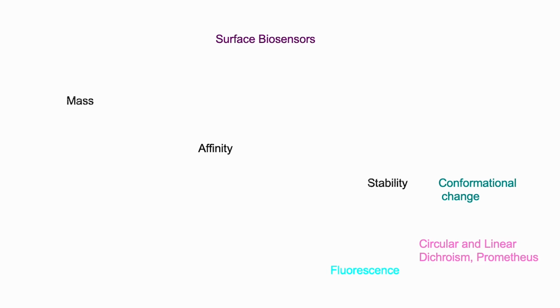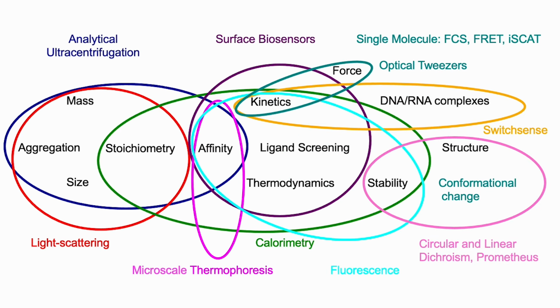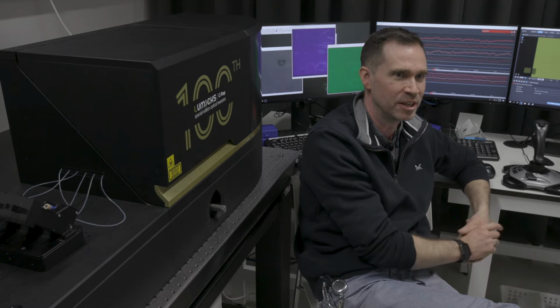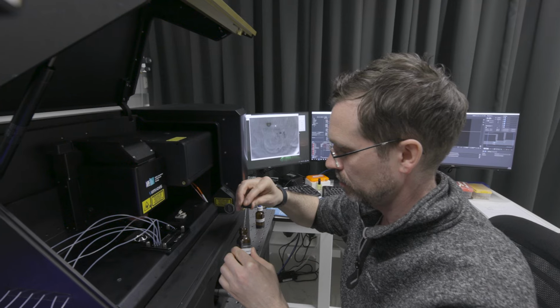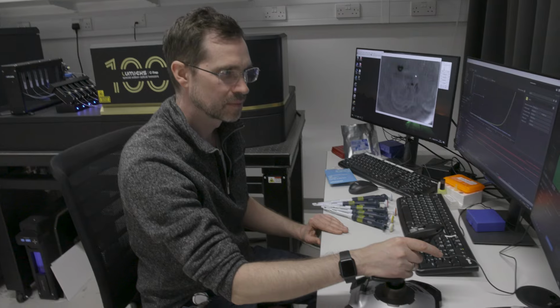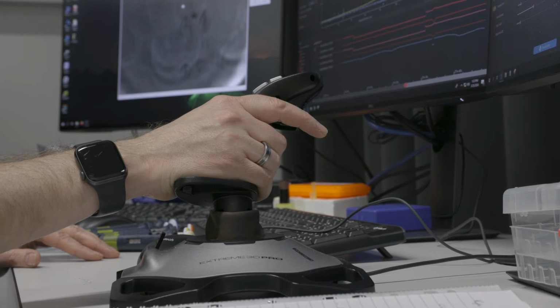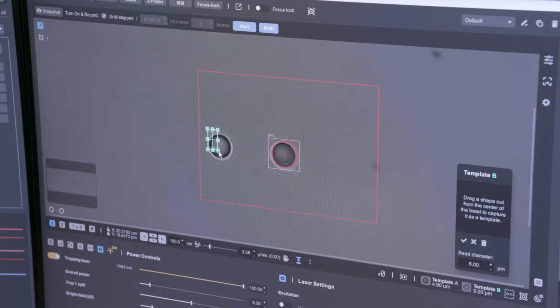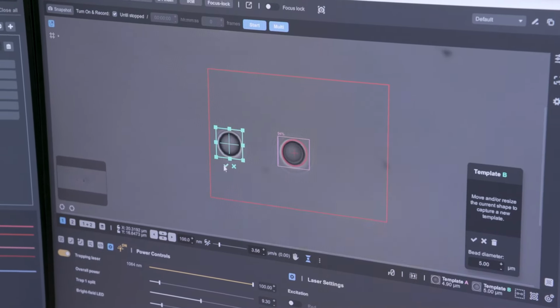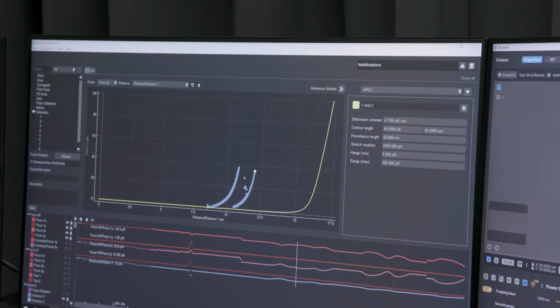Yeah, it's amazing, really. We must have 20 different pieces of equipment, all sorts of different biophysical techniques, where in previous labs where I've worked, you maybe have one or two or access to a third. We've got such a broad range of techniques that we can answer all sorts of things. In this room, for instance, we've got the C-trap, which is for looking at single molecule studies. We can pull on individual proteins and we can actually measure the forces that single proteins produce. At the same time, we can image these as well.